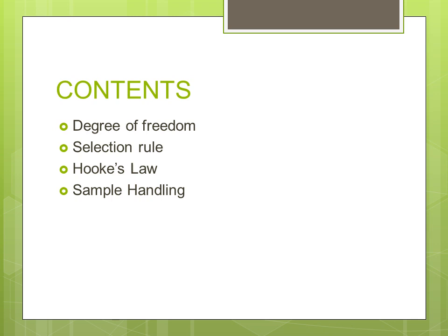Then we'll see Hooke's law, which enables us to predict at what frequency absorption will be shown by any kind of vibration. And then we will see sample handling, how our sample is introduced in the spectrophotometer.